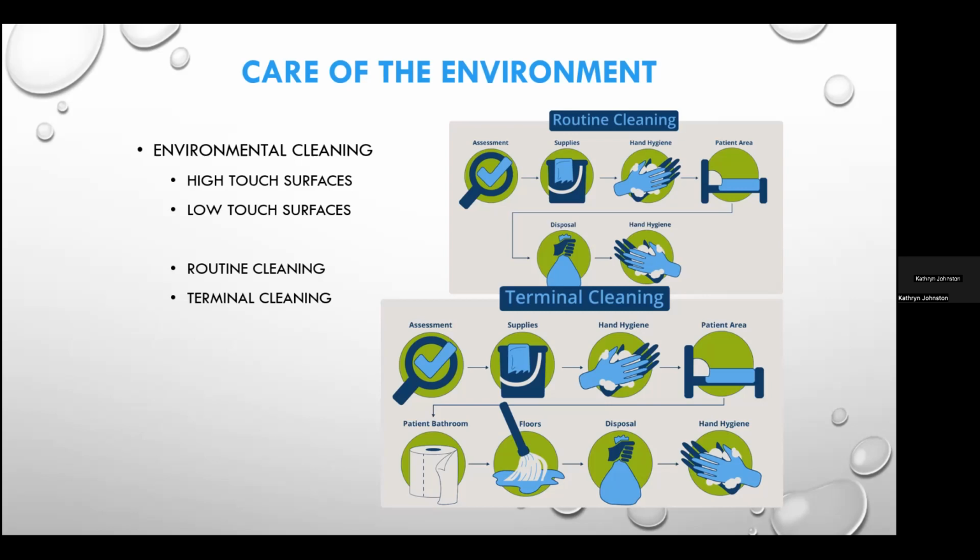So when you talk about routine cleaning and the process that it goes through, some surfaces are considered frequently contaminated given their functions. So these types of articles need to be cleaned more frequently than those that are less frequently contaminated or less frequently touched. So things like sinks, latrines, faucet handles, bathroom countertops.